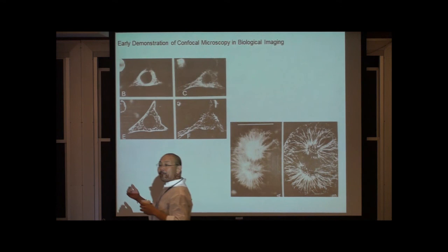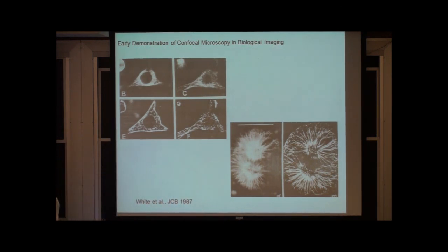And by being able to present three-dimensional resolved images, John and Bio-Rad and a number of early investigators of confocal microscopy, in some way, started the field of three-dimensional biological imaging.